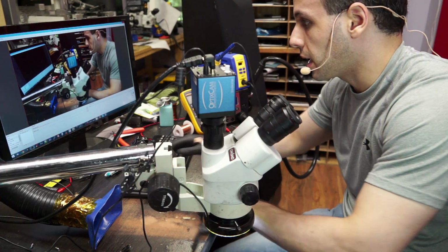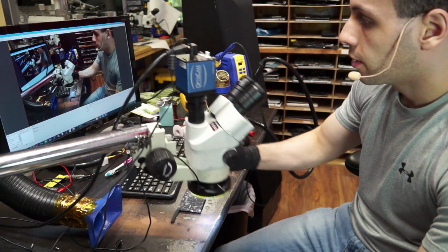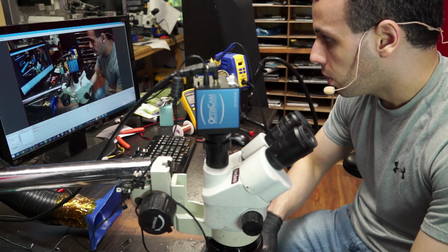See, I can't get that into focus. But if I move it outside over here onto the table, now I can do this. This is something that I usually thought I could only do with the articulating stand. But I can actually do that with the boom stand so long as I set it up so that I can look at it, so that I can have the board go under the table. And the way I do that is, again, I just swing it from here to here. And now I have all that room.